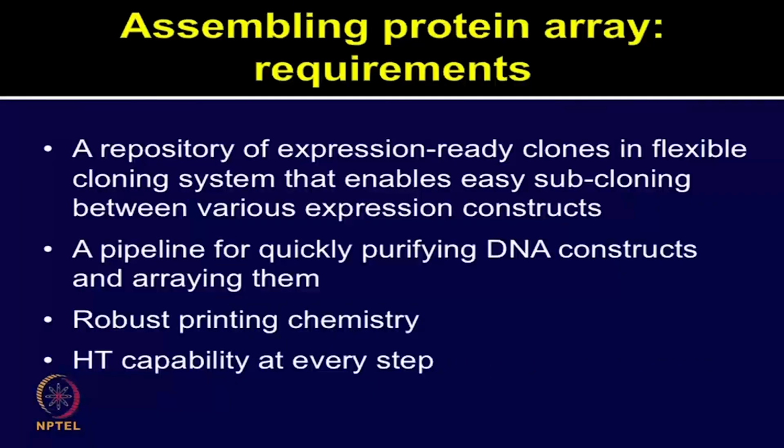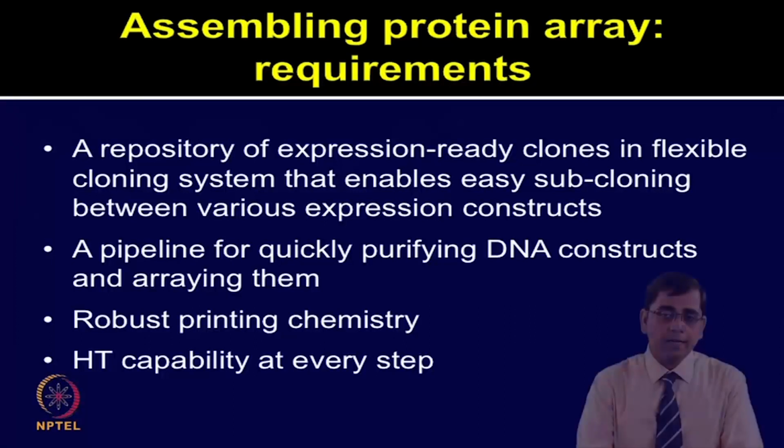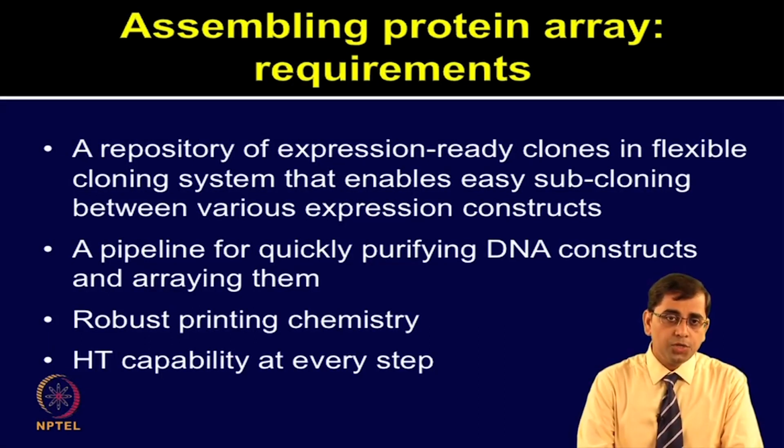So, what are the requirements to assemble protein arrays? In today's lecture, we will discuss making protein arrays, which is similar for most of the cell-free expression based protein microarrays. This workflow can be largely applied for all types of protein microarray platforms, but it will be essentially in the context of NAPPA. First of all, we need a repository of expression ready clones, which should be in a flexible cloning system.